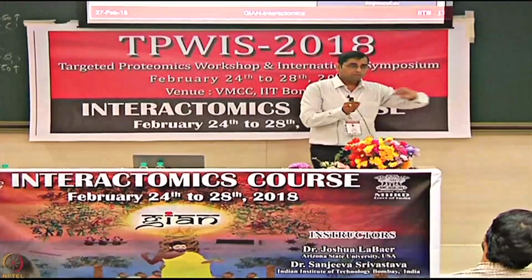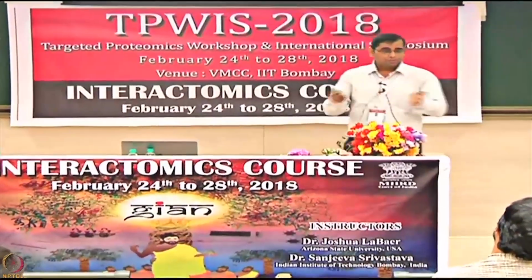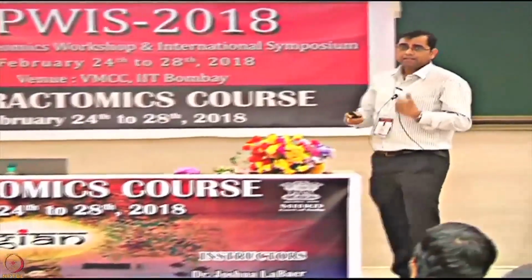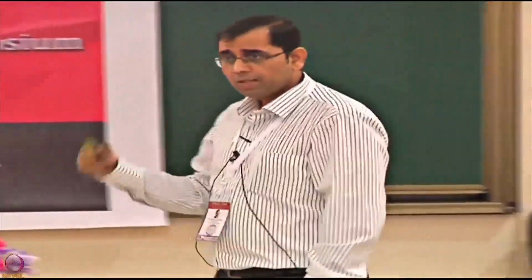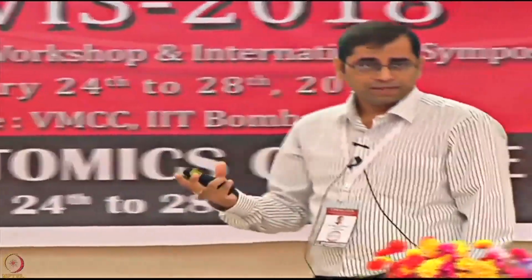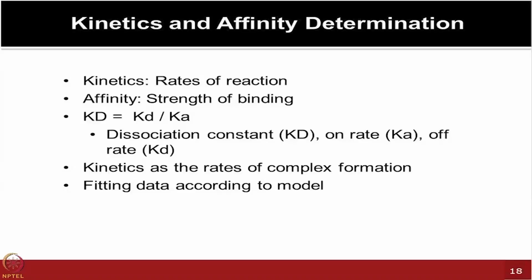off this binding of molecules without disturbing your printed molecules, and then this chip can be used again after you wash off with the buffer a couple of rounds, and the same chip could be used again for the next round of interactions. So in this way you can reduce the cost of the experiment. Otherwise the gold slides and all these chips which we are buying are way too costly.